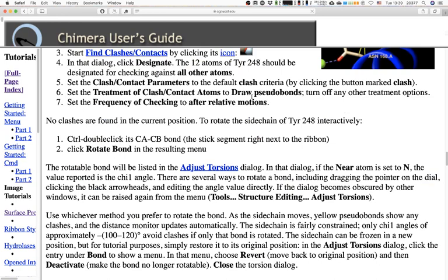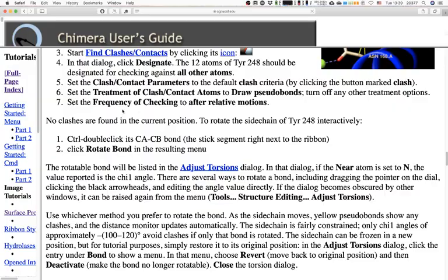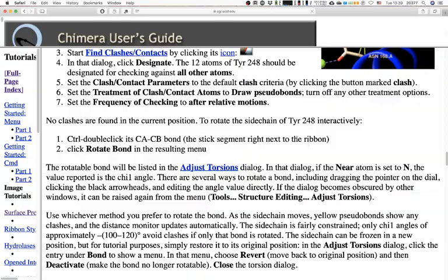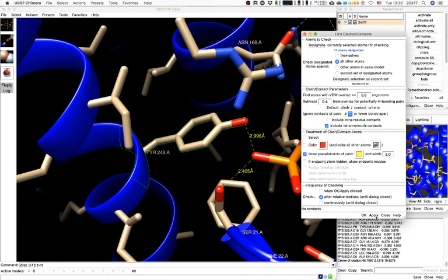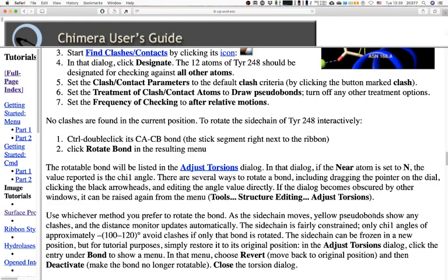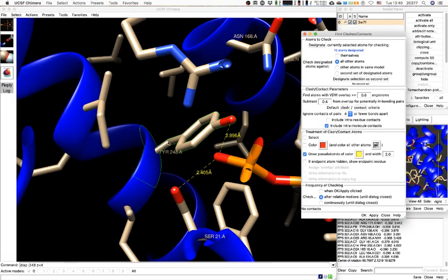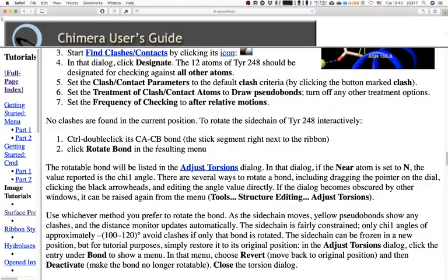Set the clash criteria, then set the treatment to draw pseudobonds only, remove everything else, and set the frequency of checking to 'after relative motions'. Click Apply — nothing happened visually, which is apparently what we want. Now control-double-click the alpha carbon–carbon beta bond. So the alpha carbon is here and the beta is this one.